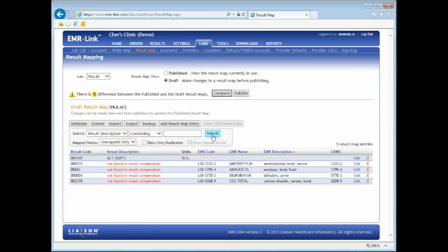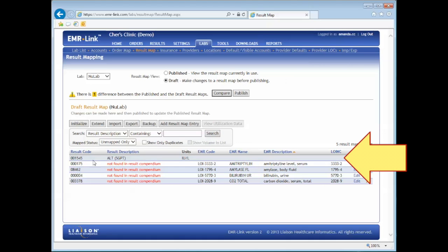Also, when a result lands in EMR Link from the lab with a result code that has not been previously mapped, you'll see these entries to be mapped to your chosen EMR code.